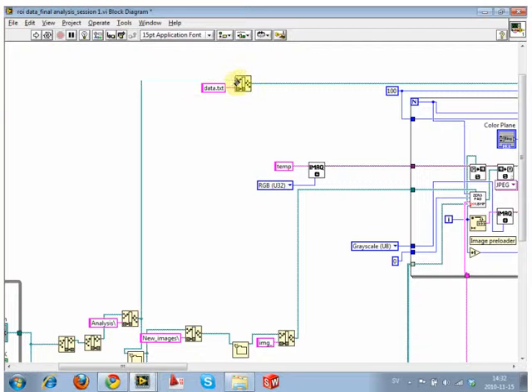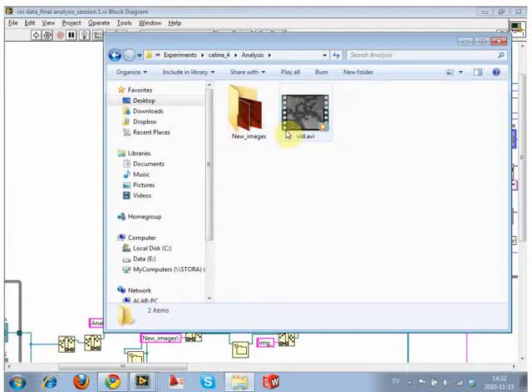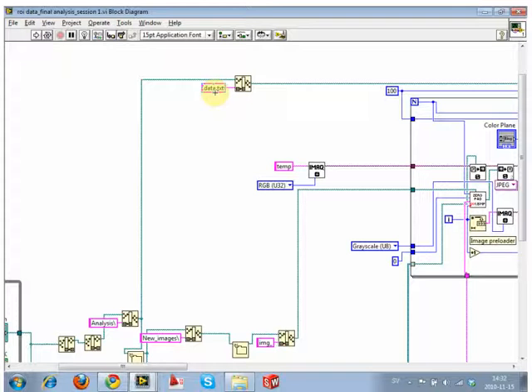Like I said, right now we're going to have a text file randomly in the root directory called data.txt, because we didn't tell it where to put it. And like I said, you're going to make files all over the place. It happens, especially when you do stuff like I did, which is just delete my entire structure for the files. But now if we quickly rerun it again, we should make sure we get that file in there too.